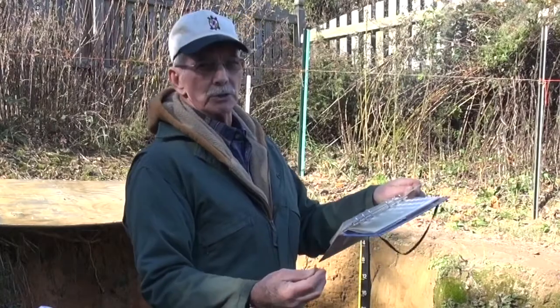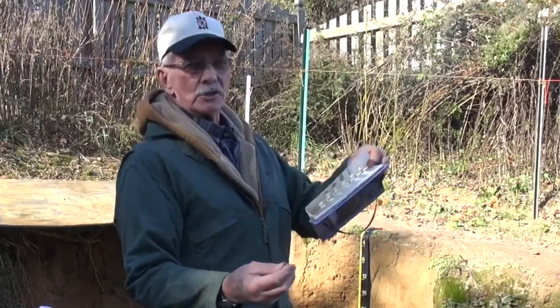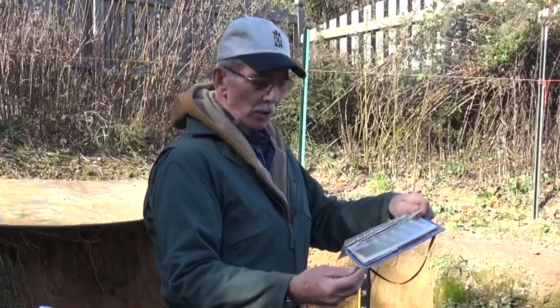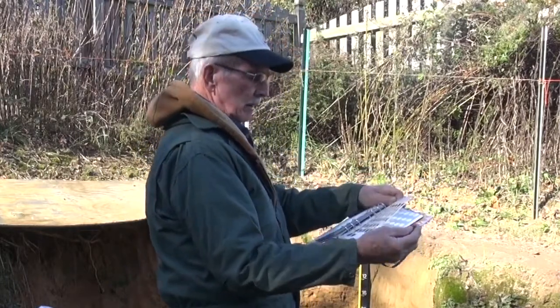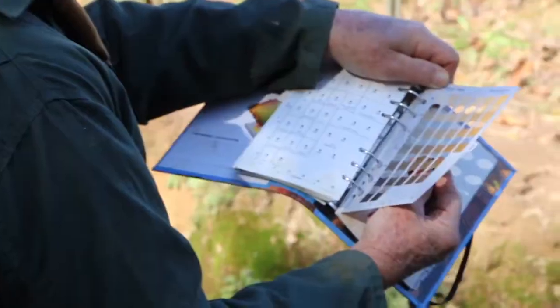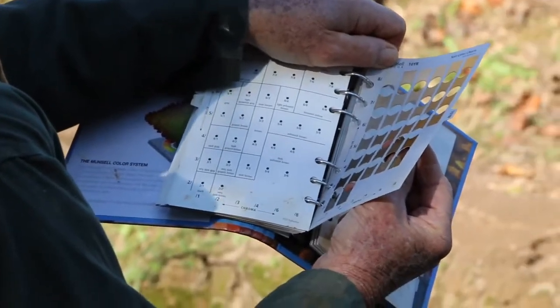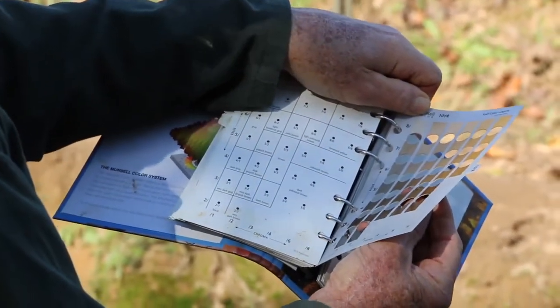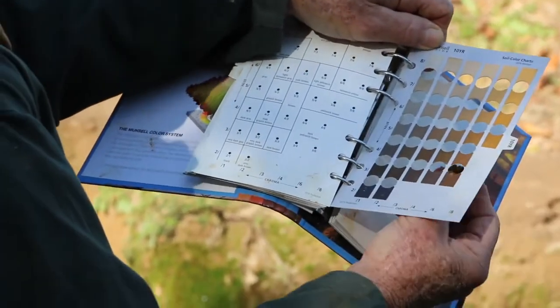The ideal situation is to pick the right time of day, have the sunlight coming over your right shoulder, and place the structural pad behind the chip. Compare it with these color chips just like you were working with a paint sample and identifying which chip best corresponds to the color of the material you're working with.